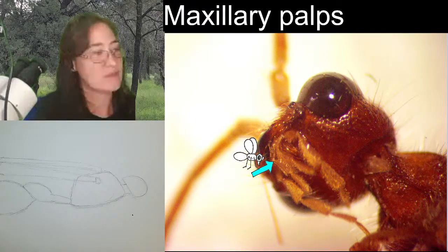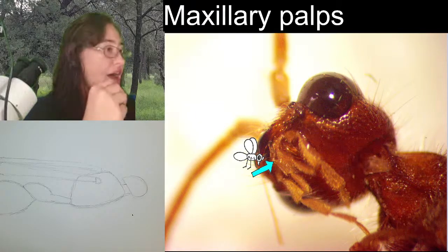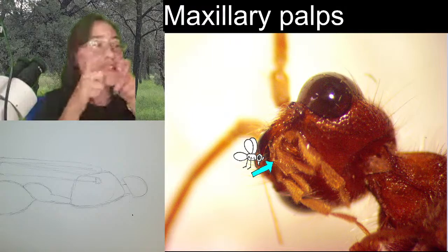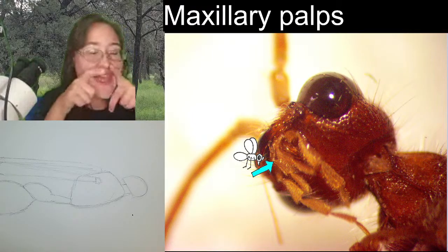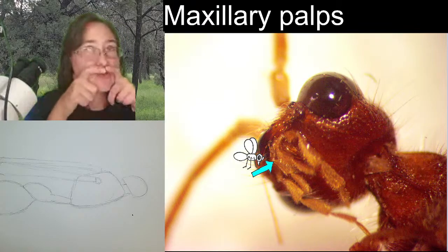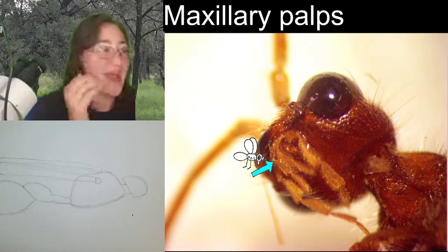So, to get you guys the words, maxillary palps are going to be the longer ones. Generally, they're the ones that are kind of on the side here. They exist on the segment directly underneath the mandibles. So they are the ones that are helping push food into the mouth or into the mandibles.